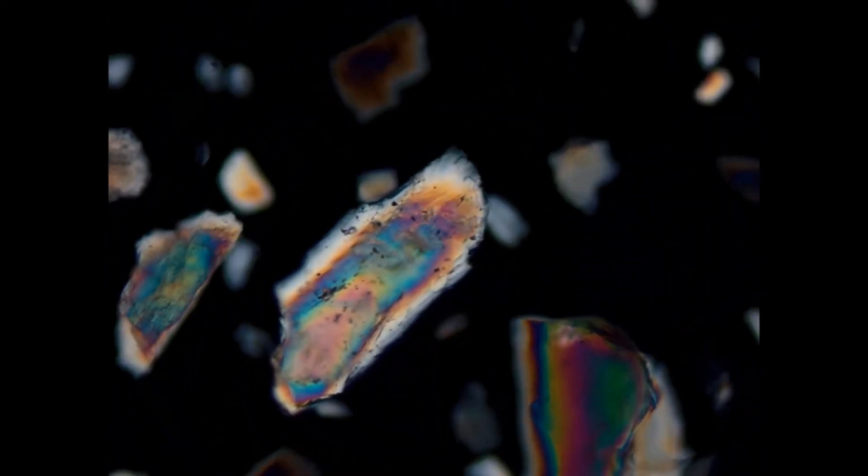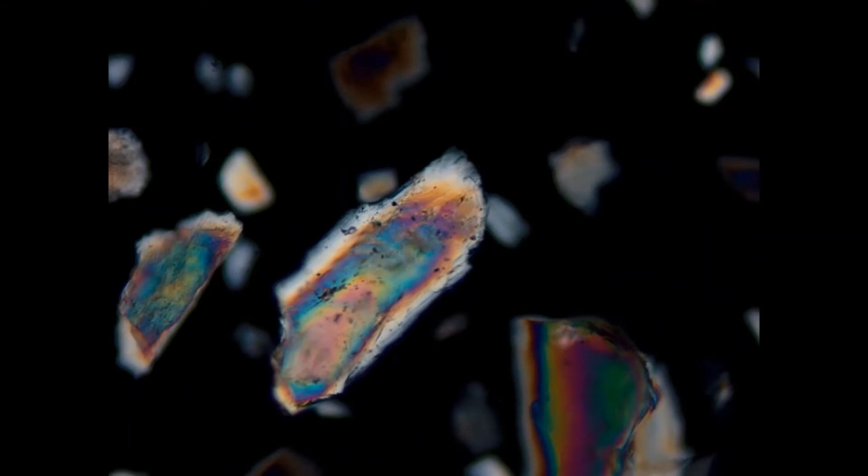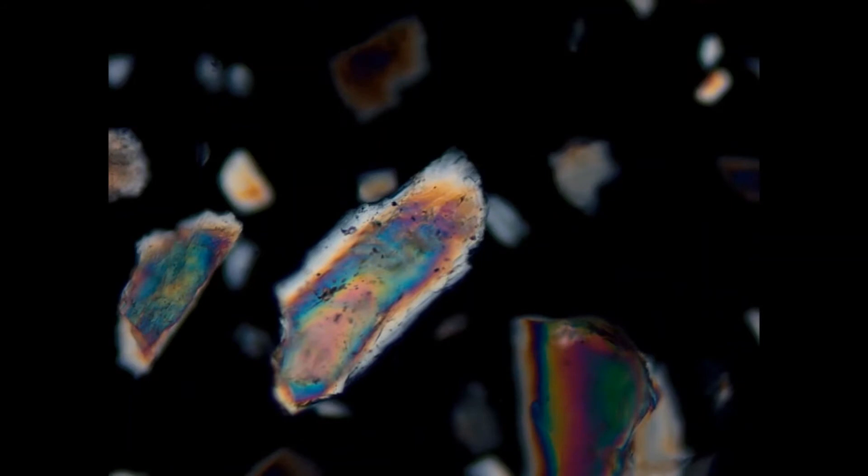If we rotate the grain into a north-east-south-west orientation and we test for the elongation, we can see that the rims of the grain have white and grey interference colors of the first order now.